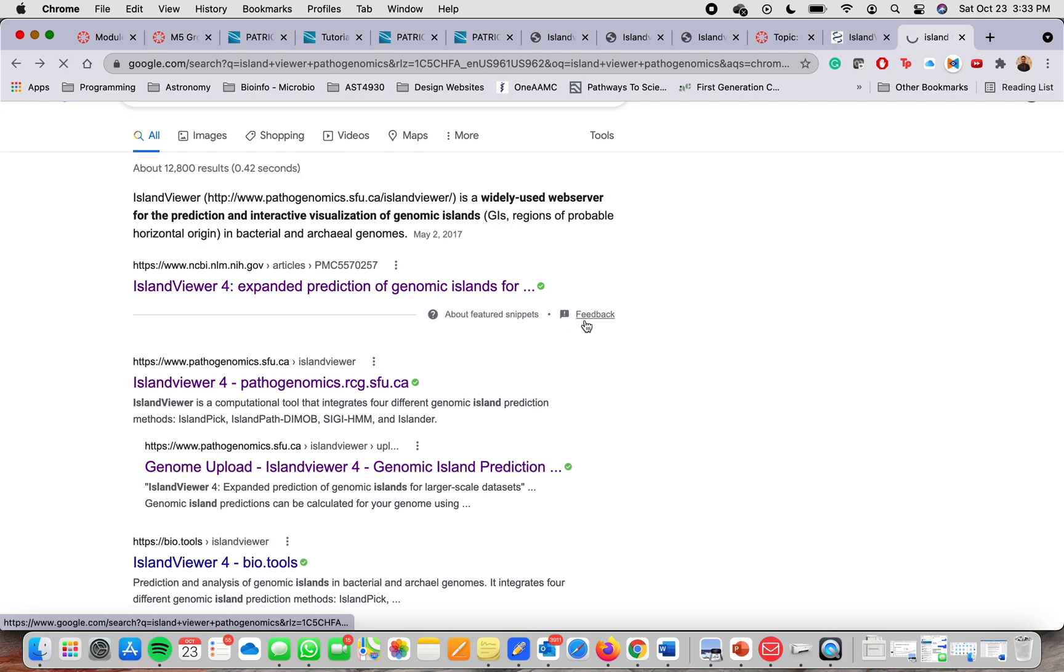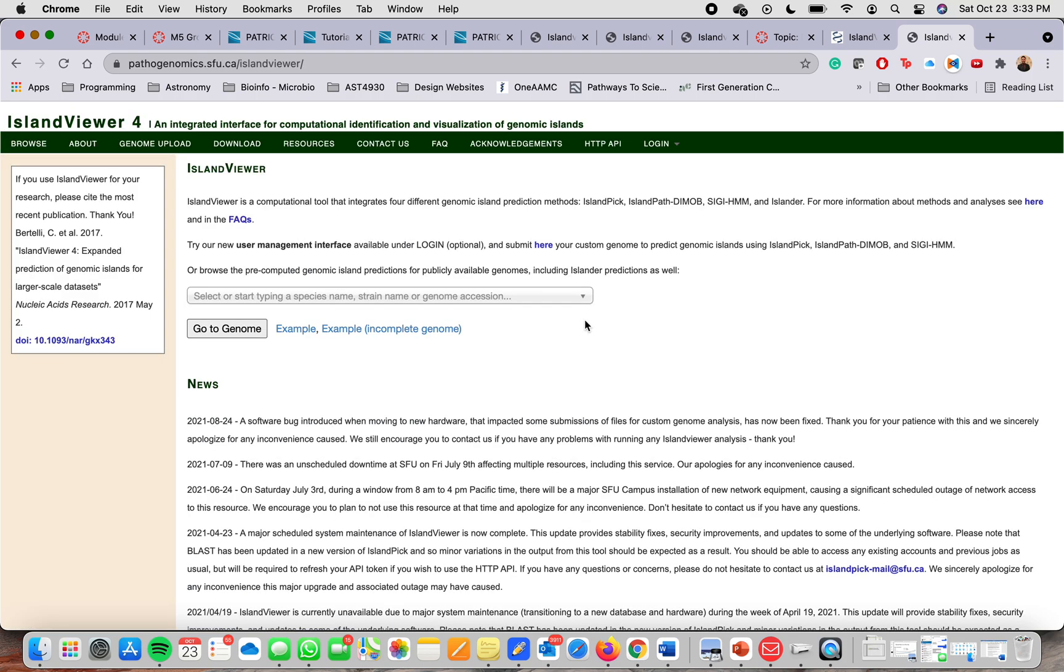So this Island Viewer is a widely used web server for the prediction and interactive visualization of Genomic Island.